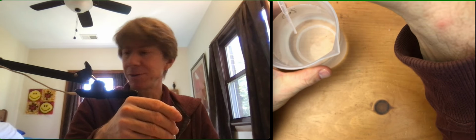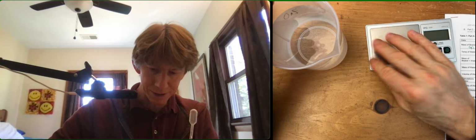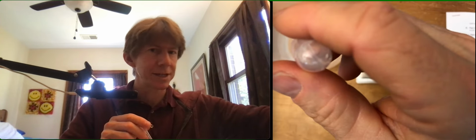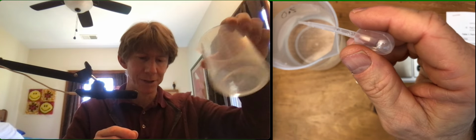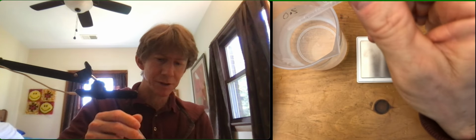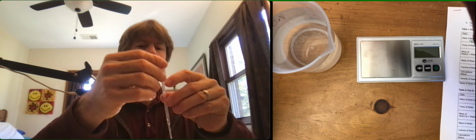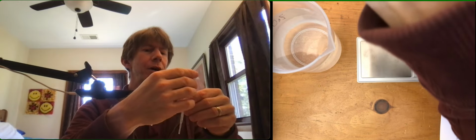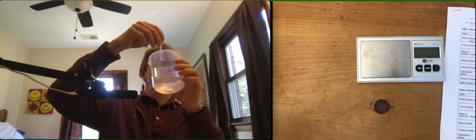Now this is the part you have to be really careful about. So I've got my scale right here. The scale got a little water on it, so I'm going to wipe that off. Now I've got the beaker that I'm going to be putting it in, which is my 250 milliliter beaker. Make sure you get the right one. And I'm going to fill my pipette up to the 1 milliliter line. And the 1 milliliter line is right there on these. And it says 1 right above it. And I'm going to suck it up to right there.